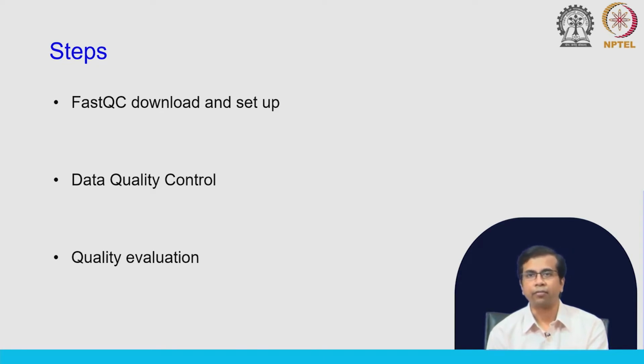And as we have discussed, FASTQC will generate certain statistics for you and we need to make sense of that statistics and we would have to make decisions ourselves, right. What we want to do before we actually go for downstream analysis. Do you need any pre-processing? Do you need any trimming? Those decisions would have to be taken by us. Okay. So, let us start.